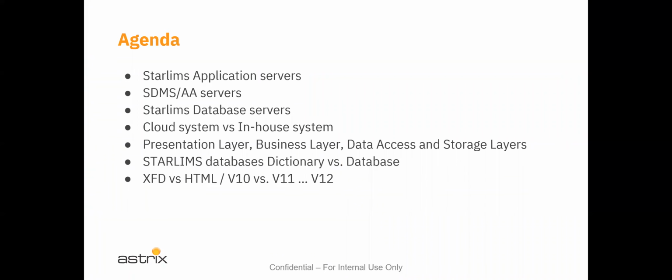We're going to talk about STARLIMS application servers, SDMS and AA servers, which is the STARLIMS document management system, and the advanced analytic products that are provided by STARLIMS. We're going to talk about the STARLIMS database servers, the cloud system versus the in-house system. We'll discuss the presentation layer, the business layer, the data access and storage layers. We'll talk about the STARLIMS databases, the dictionary versus the database. And we're going to talk a little bit about XFD technology versus the newer V12 HTML version.